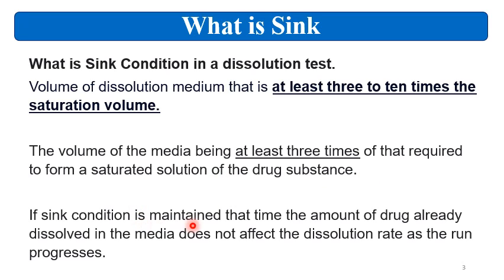If sink condition is maintained, the amount of drug already dissolved in the media does not affect the dissolution rate as the run progresses. That means the dissolution medium should be such that it is 3 times the volume required to form a saturated solution. If 100 ml is the saturation volume, then the dissolution medium will be at least 3 to 10 times that 100 ml saturation volume.